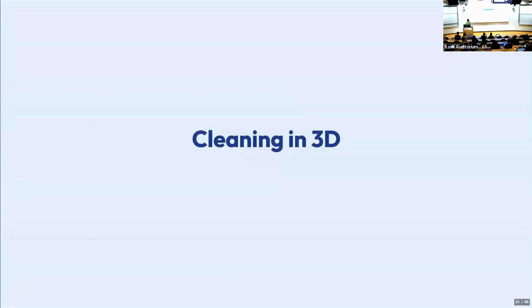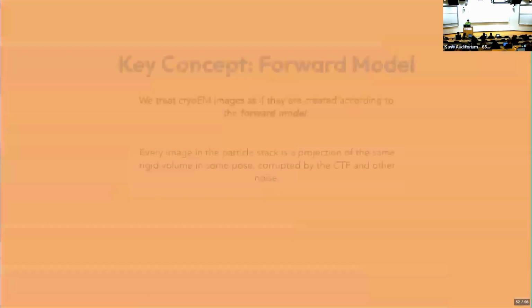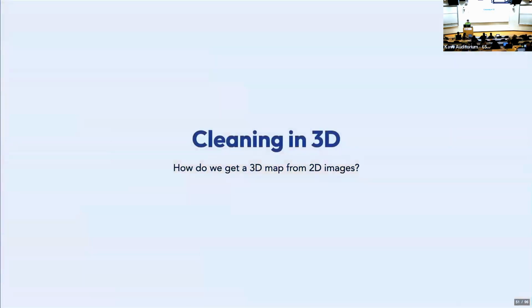Because of that, I and others in the cryo-EM community generally recommend doing a lot or most or all of your cleaning in 3 dimensions. And the reason for that is we are really, really bad at, in our head, taking a 3D volume, rotating it, translating it, and then projecting it into 2D space, okay? That's just not something we're good at. Sorry, I forgot my own slideshow.